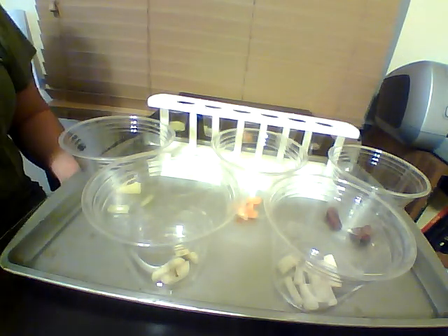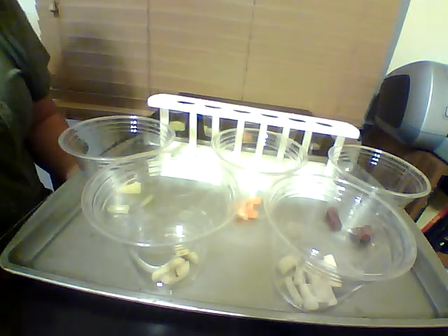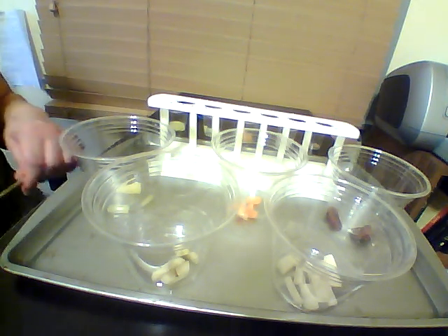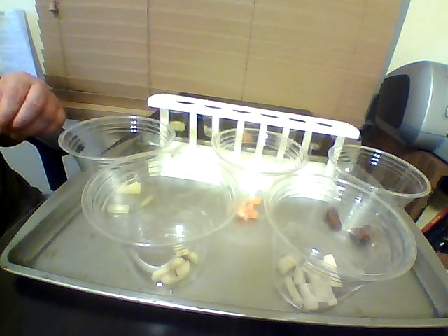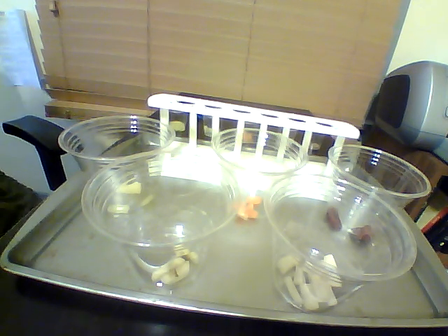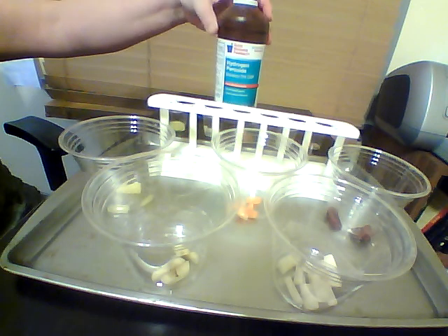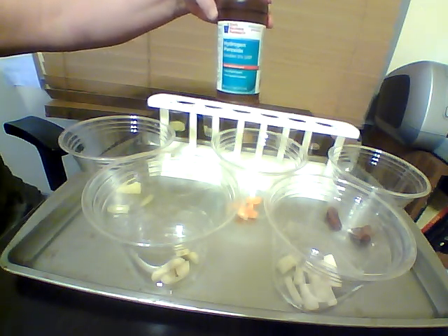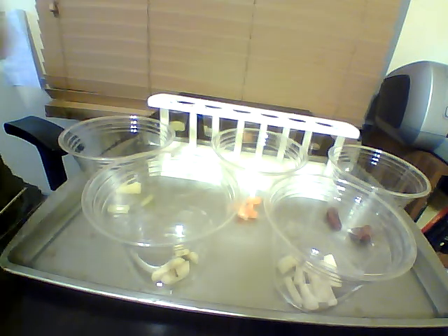Hi guys, today I am going to videotape a little lab demonstration for you. In this lab we are looking at the effect of catalase, which is an enzyme in our bodies and all of our cells, on hydrogen peroxide. The hydrogen peroxide bottle looks like this. You guys are probably familiar with it. Its chemical formula is H2O2.